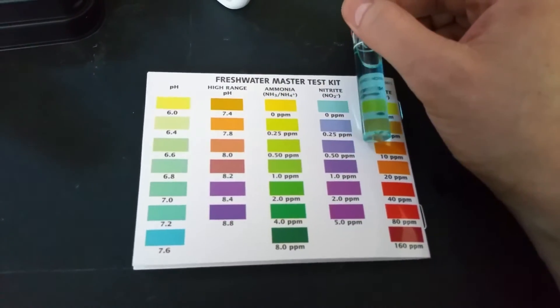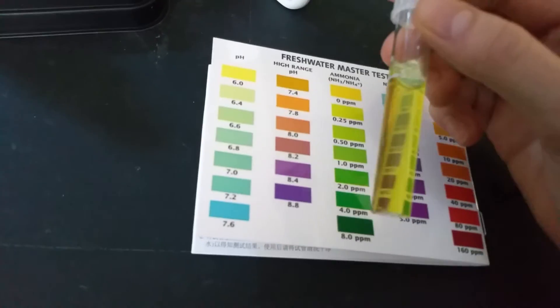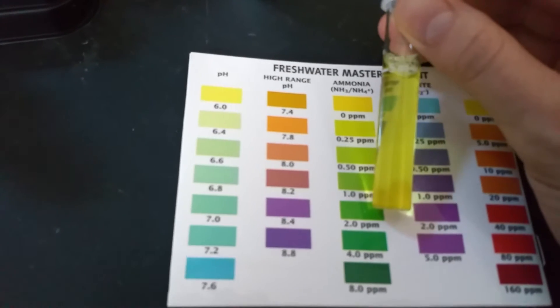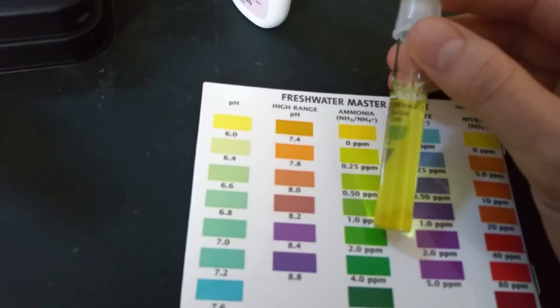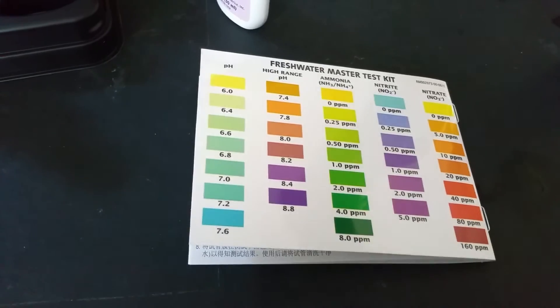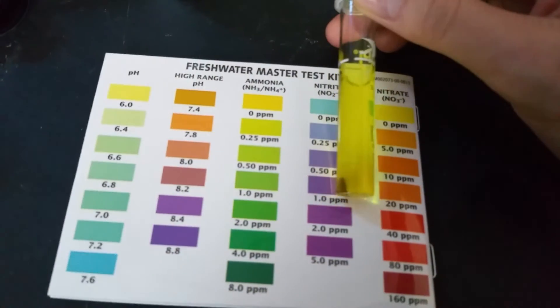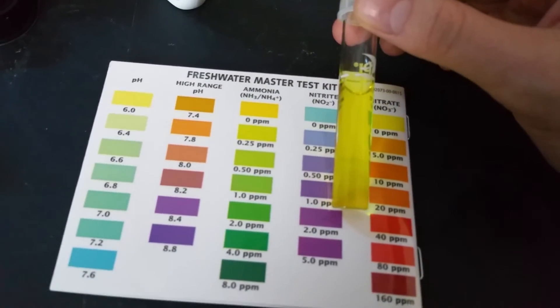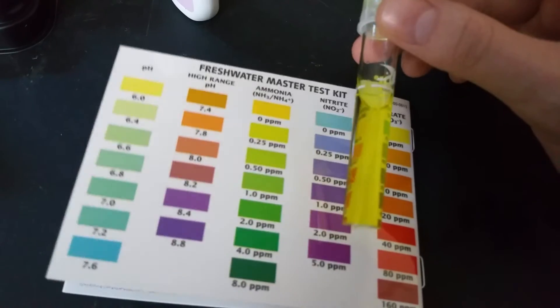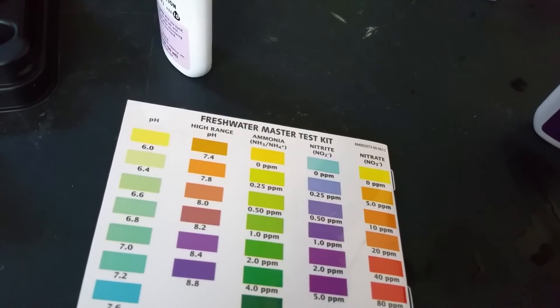The nitrite is 0, which is very good — you do not want any nitrite in your tank at all. Next is ammonia, which is reading 0 as well; it's pretty much pure yellow with no green, which is what you want. Last week I had a bit of ammonia, but doing water changes definitely helps. The nitrate is also about 0, though it's actually not a bad thing to have about 5 ppm of nitrate according to some people.